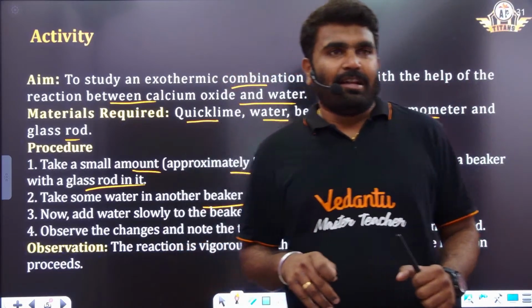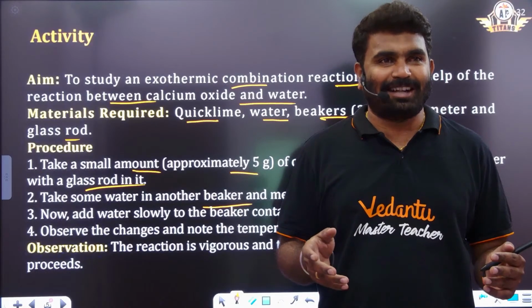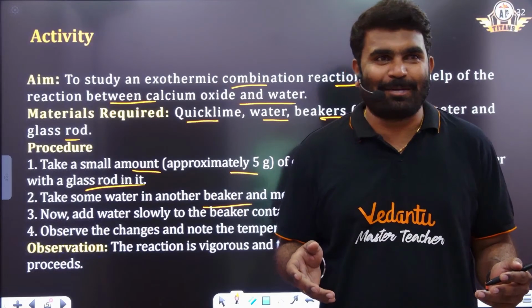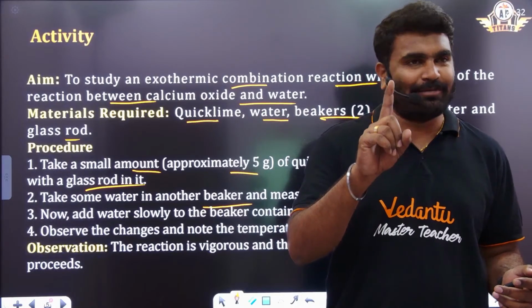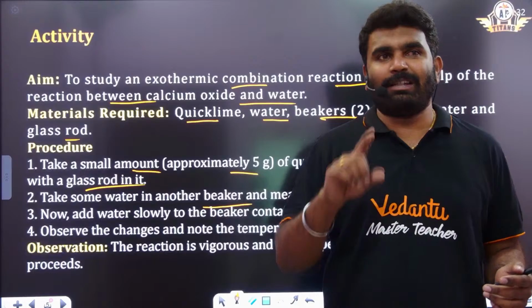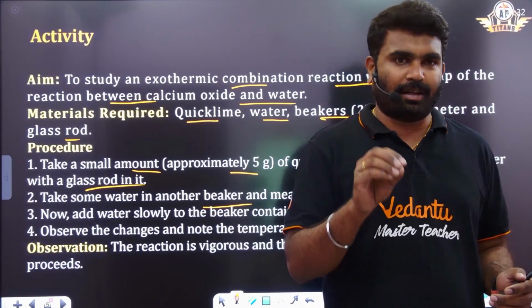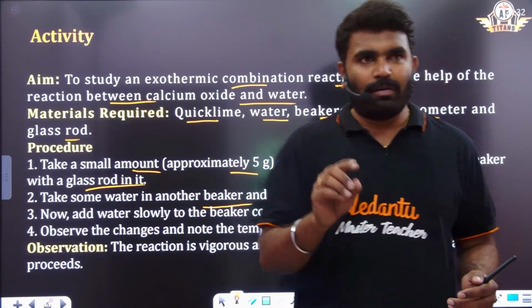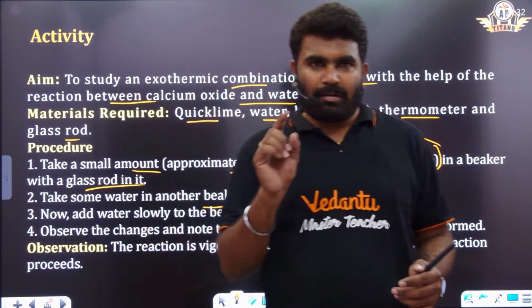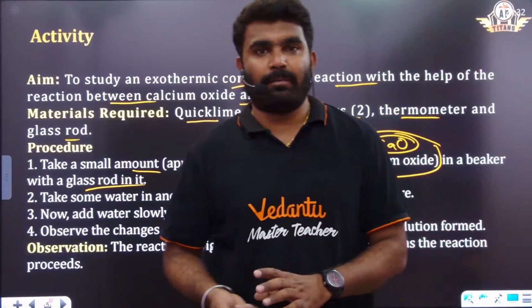I tried something but it failed with the magnesium ribbon, but one more activity I'll definitely do for you. In all these activities I am going to do another activity. The required material is there with me. So we'll do one more activity. In total I think there are about 10 activities. So out of the 10 activities I am going to do one more activity.